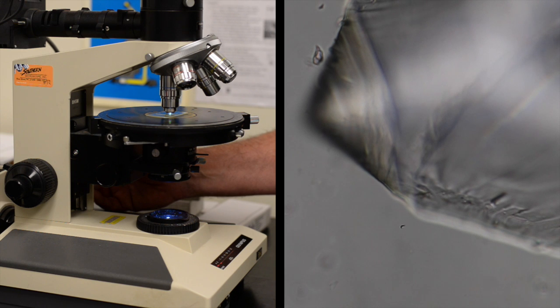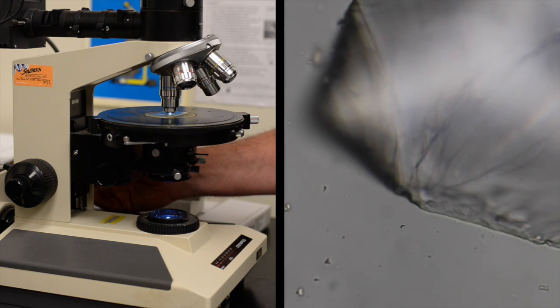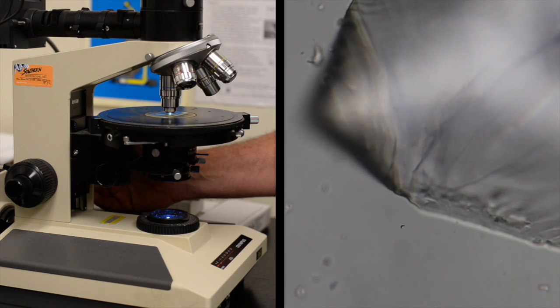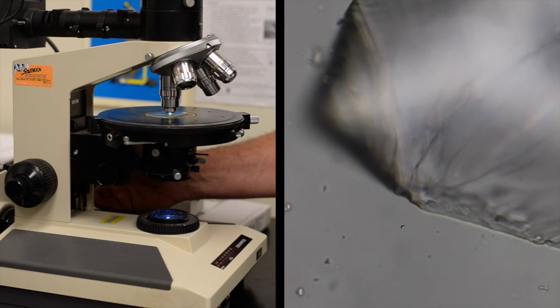The principle here is that the halo moves into the substance with the higher index of refraction. In this case, the epoxy, which has an index of refraction of 1.53, is higher than the mineral's index of refraction, which must be essentially something less than 1.53. We can't quantify that, but in a qualitative way, we can say that. And that may or may not be an aid to identification if you have an unknown mineral that you're looking at. All right, so now you know how to do a Becke line test.